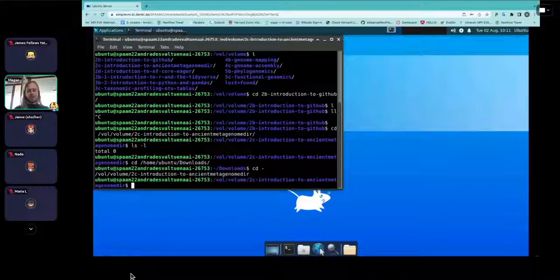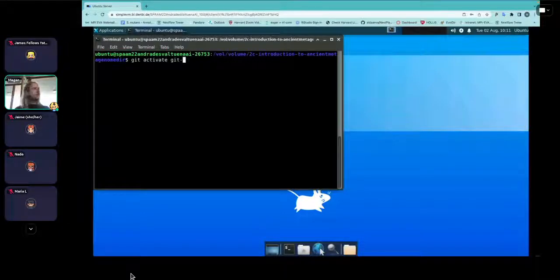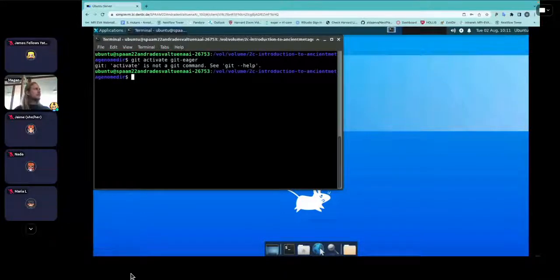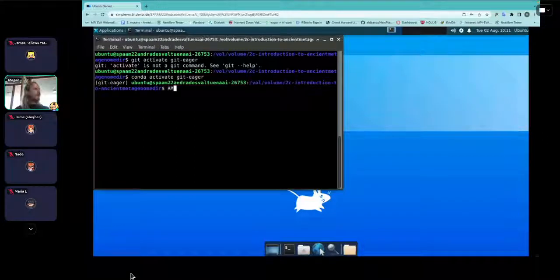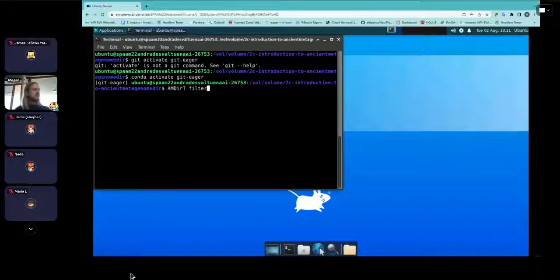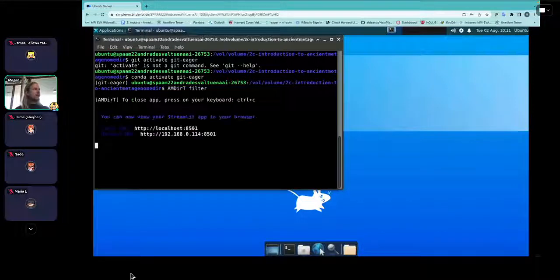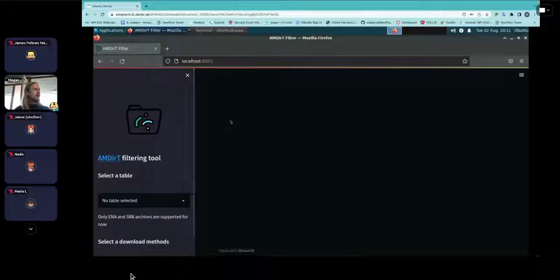You should have run 'conda activate git-eager'. Then run 'AMDirT filter'. When you do this, your web browser should pop up and you should see the AMDirT interface. Is everyone seeing something like that?